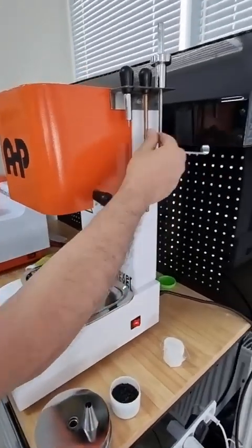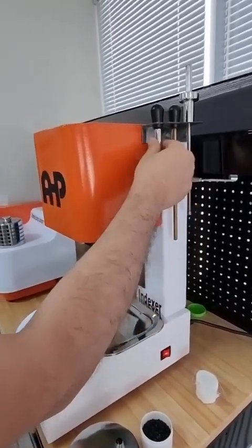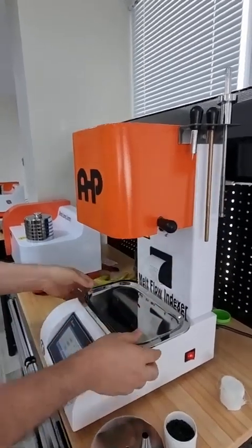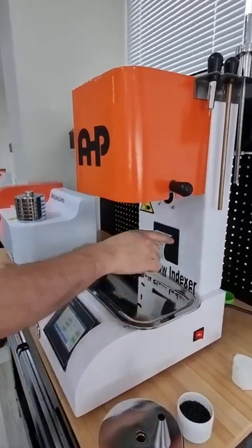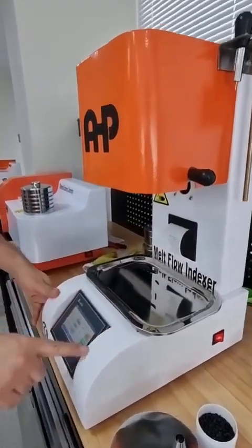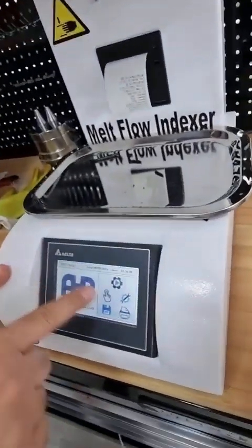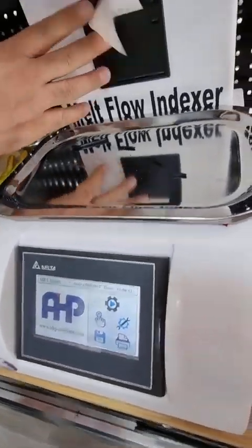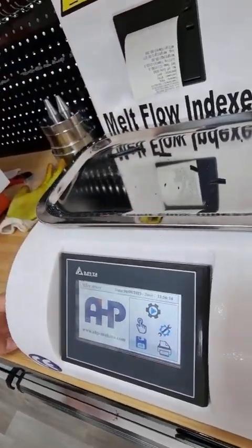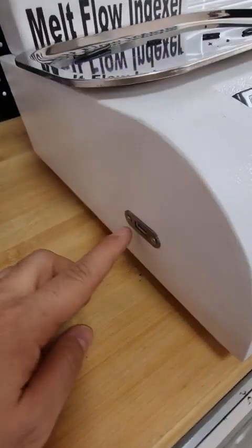It comes with a whole pair: a piston, a cleaning rod, a brass cleaning rod, a rod, a pin for cleaning the die, a steel tray, and paper for the thermal printer. The basic machine has a 7-inch touchscreen and a thermal printer installed on the unit for printing the last report.